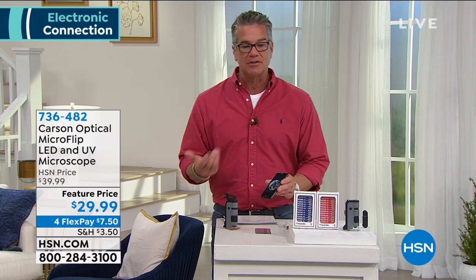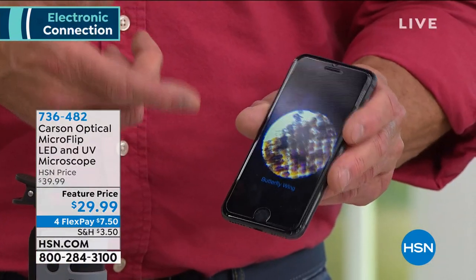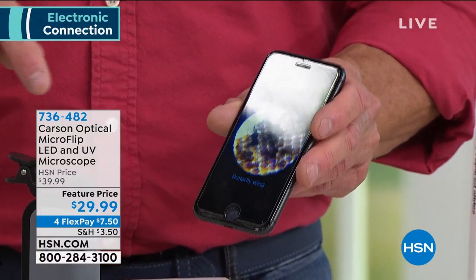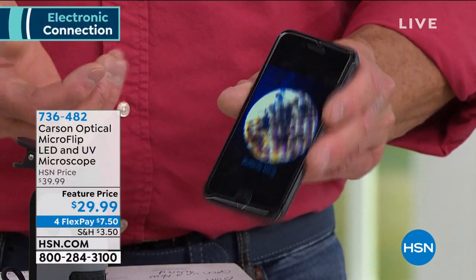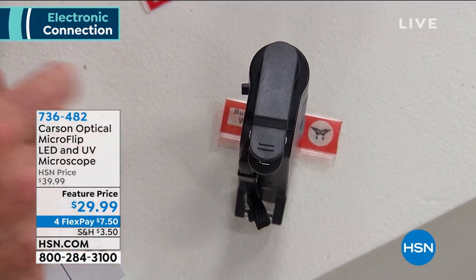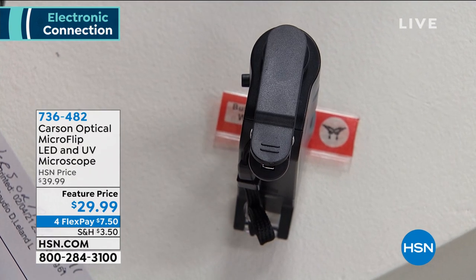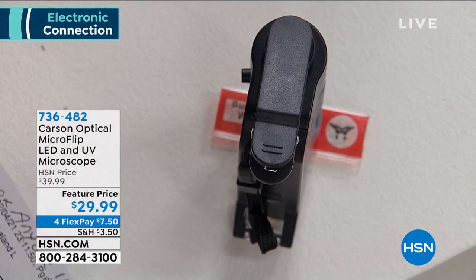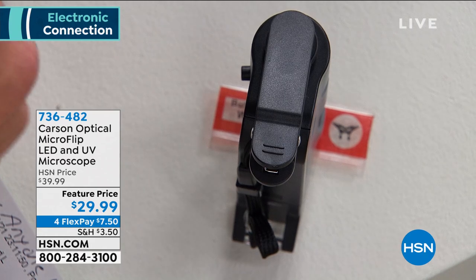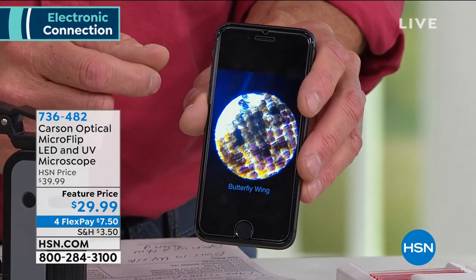It's really, really cool. So we have one set up right here. And to Doug's point, we actually hooked it up to our cell phone. So if you've got a smartphone, you can actually see what you want rather than looking right in. You can clip it onto your smartphone and utilize that. What we've got here is we put inside a butterfly wing, and I want you to see, are we doing it behind me, or are they just going to get a shot of the phone? We're over the top, I think. Okay, so here's what a butterfly wing looks like.